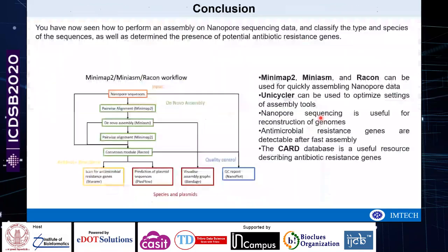So this is what I have prepared, and these are the steps I have gone through to predict the drug resistant determinants from the raw sequences of nanopore data.